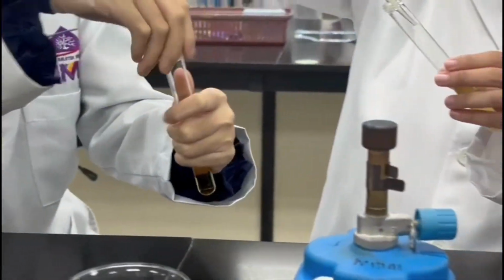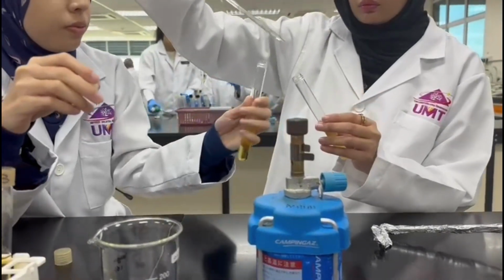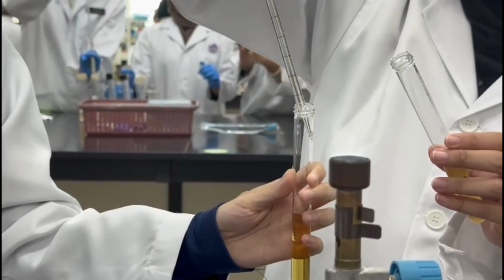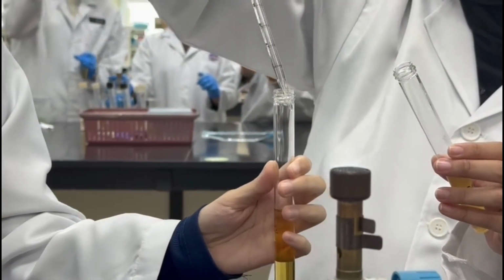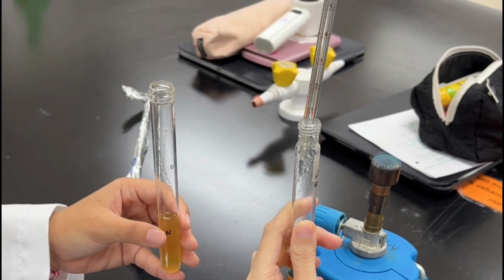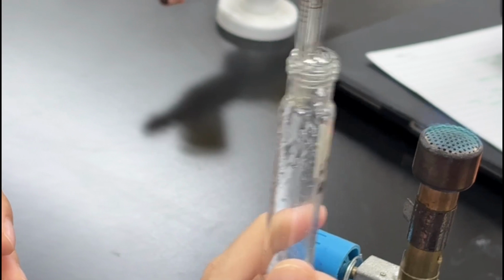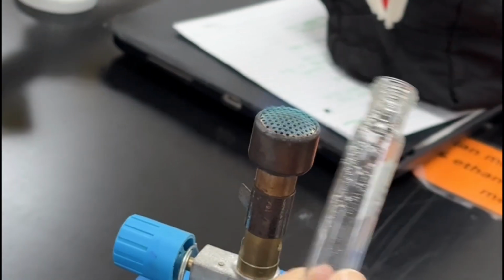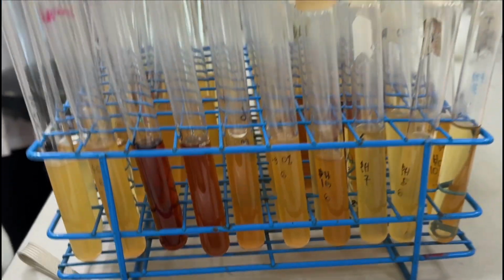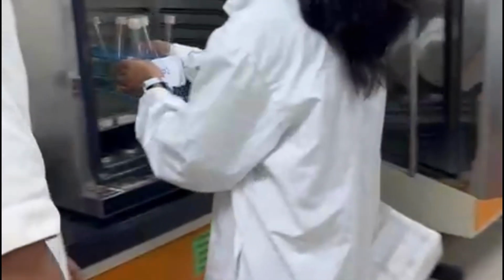For the effect of pH, add 0.1 ml of the same culture into 4 TSB tubes adjusted to pH 3, 5, 7, and 10. To test the effect of oxygen, add 0.1 ml of the same culture into 2 TSB tubes. In one of the tubes, add a thin layer of paraffin oil on the surface to block oxygen. All of these are then incubated at 37 degrees Celsius for 24 hours.